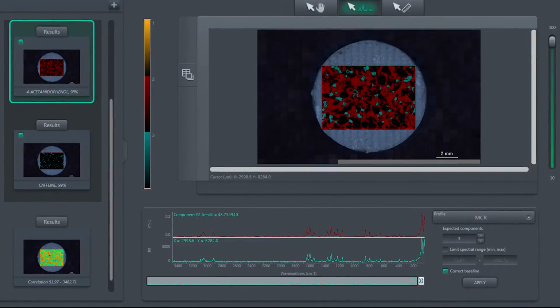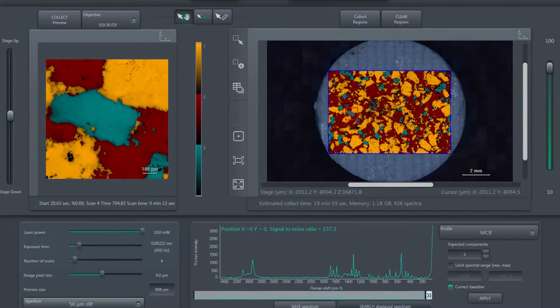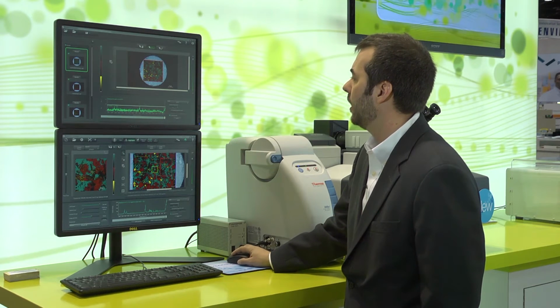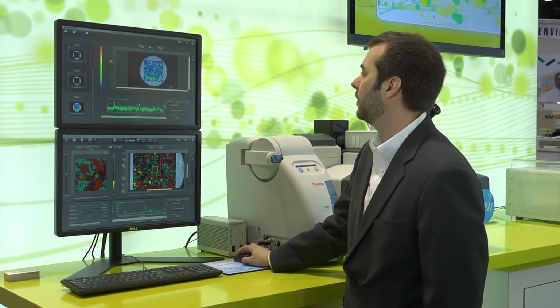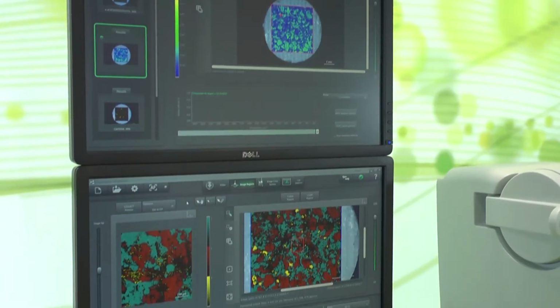We're also showing how you can perform many different experiments after the data has been collected to do analysis or post-processing, interpreting the data in many new and different ways. So that's as simple as just selecting a few parameters that allow you to refine exactly what you're looking for, look at different spectral features, for example, and really gain a visual understanding of your image.